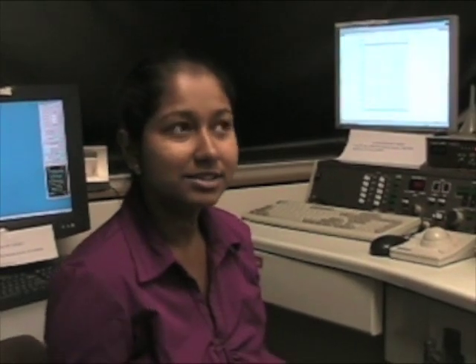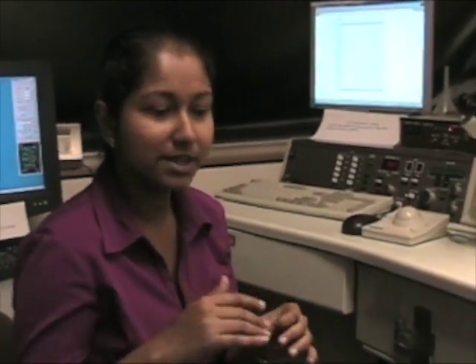And then about how many images do you take? It depends on one's expertise. The idea is based on how homogeneous your samples are, and the only way to check that is by going over and over in different areas of the TEM grid. So technically I would like to take 8 to 10 images per sample. And you're using 4 samples.